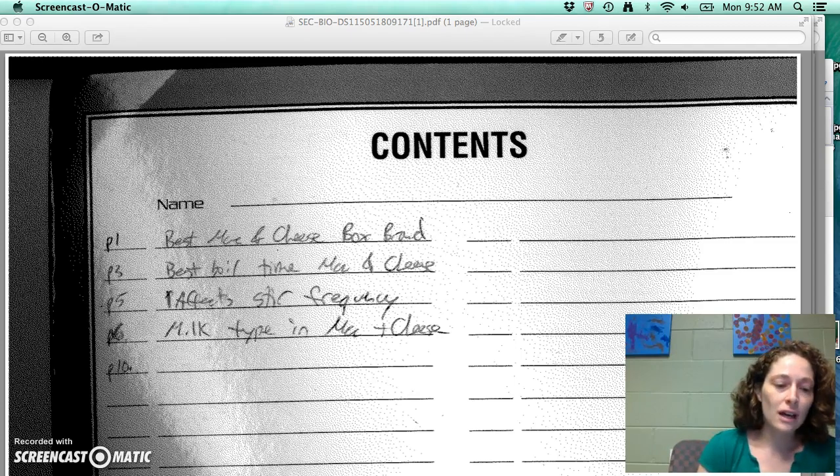For our lab notebooks, we want them to be bound with numbered pages, and we want them to have carbon copies. That way you can tear out a page and hand it into your instructor or TA for grading easily. Notebooks, I should also mention, are legal documents, so you do not own your lab notebook when you work in a research lab. Your lab owns it, and they will keep it when you leave the lab. And in terms of the courtroom, they can sometimes be brought in when there are patent disputes, and you have to prove when you actually made a discovery.